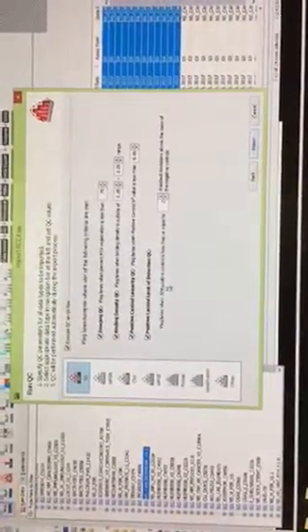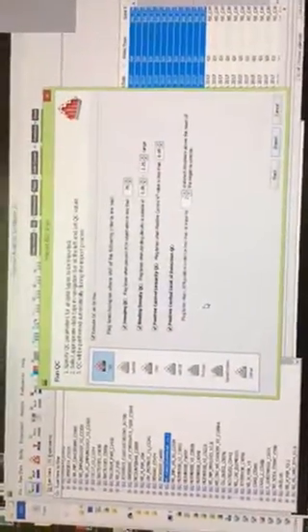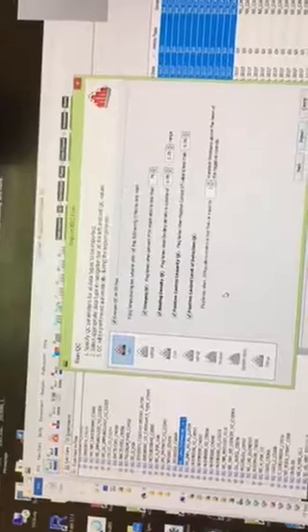There's also the limit of detection, which looks at the 0.5 femtomolar positive control. It looks at one of the lower positive controls and makes sure that it's greater than 2 standard deviations above the mean of the negative control. My quick way of explaining this one is that it's making sure the positive controls are robust compared to the negative controls.